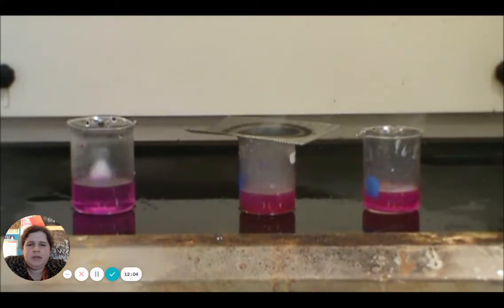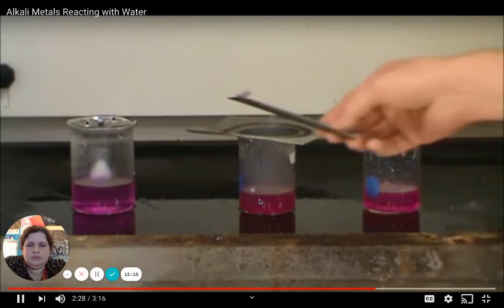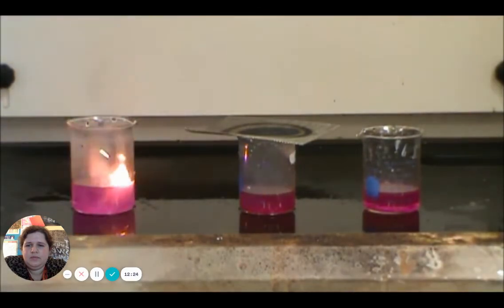I'm guessing that pink stuff is probably an indicator dye to tell us that sodium hydroxide is being made. Now that potassium there was quite reactive, but the sodium sometimes will allow hydrogen gas to build up. In this case, it's not igniting. But we can try adding another piece here. He's adding some more sodium. We can hope that that's going to actually send off some shrapnel and some flame. So he's trying to make things blow up. How reassuring.